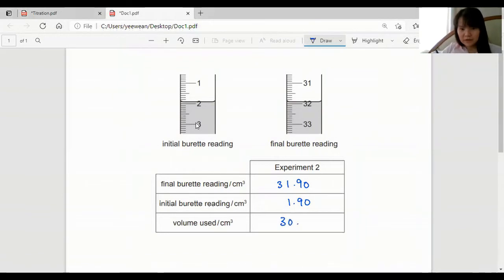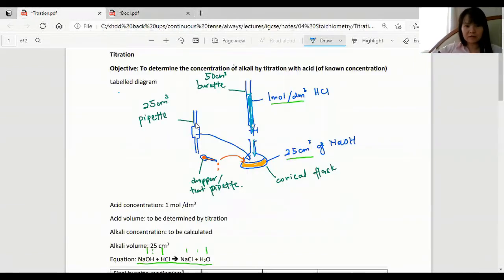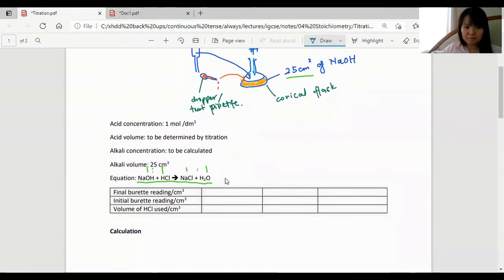So 30 centimeter cubes went into the conical flask. Let's record that here. I put those readings here.